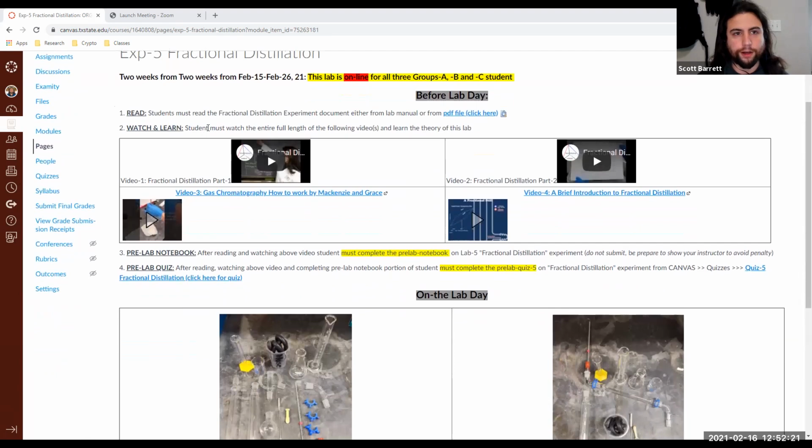So on your own accord, please make sure to go ahead and watch these videos. Mainly today we'll be talking about fractional distillation right here. Watch part 1 and part 2 on these links within the module. And through the lab manual, there is not a gas chromatography section described there. So please make sure to watch this video created by Mackenzie and Grace. And finally, video 4 will be an additional informational guide towards fractional distillation if you need any more clarifications after I go through the lab manual with everyone.